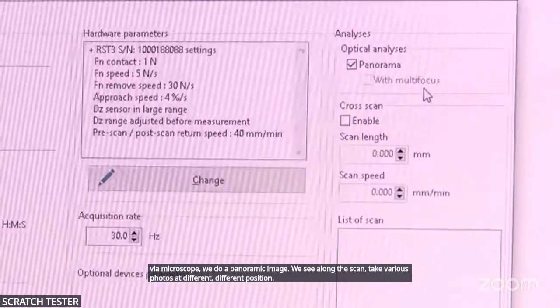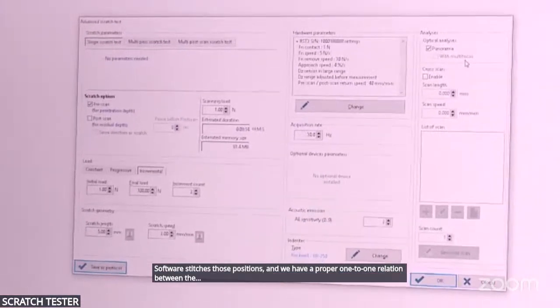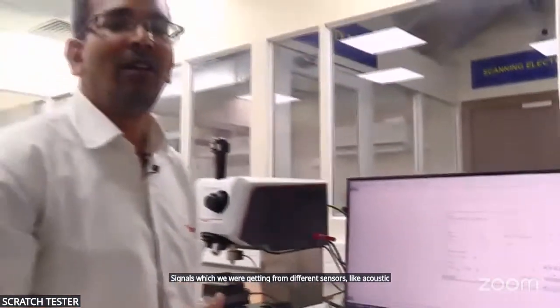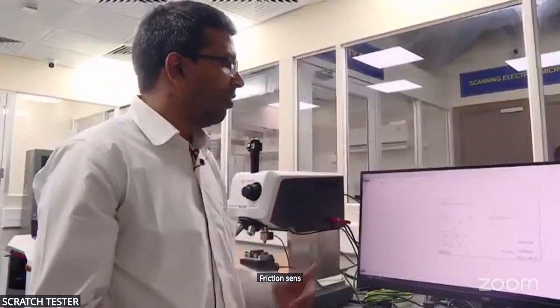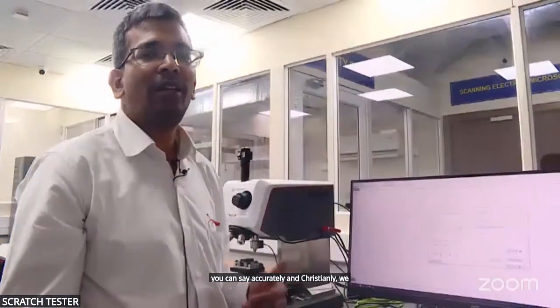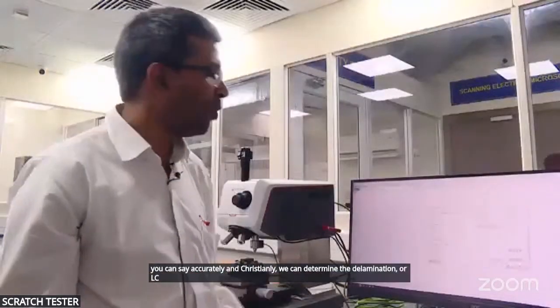Software stitches those positions, and we have a proper one-to-one relation between the signals we were getting from different sensors like the acoustic sensor, friction sensor, and all those, and the image. So more accurately and correctly we can determine the delamination or LC1, LC2 crack points in the system.